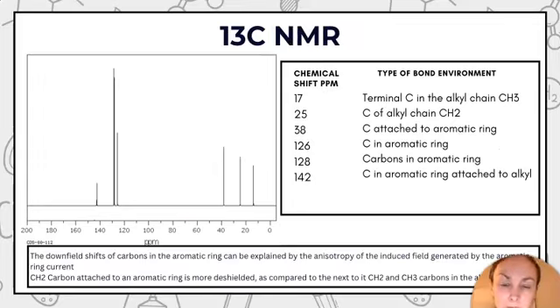Carbon NMR can show us the carbon environment in the compound. Now we could see the aromatic ring. It's important to know that the same range is observed for non-aromatic alkenes. It's about 110 to 150, but because we did have infrared spectroscopy indicating the presence of an aromatic ring, that gives me confidence that these are our aromatic carbons.